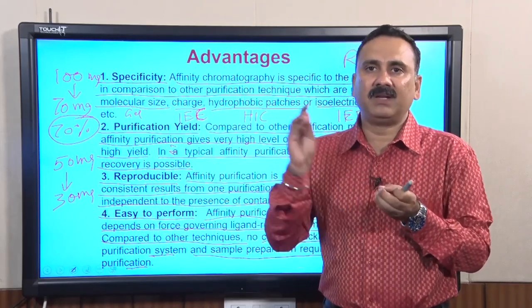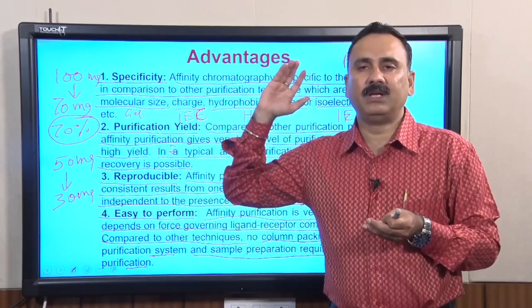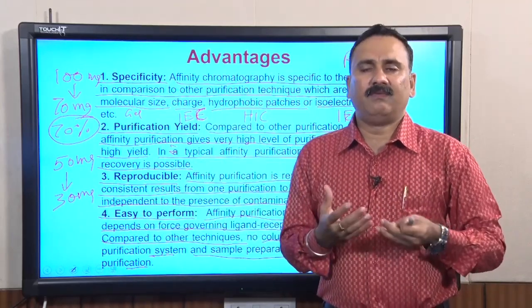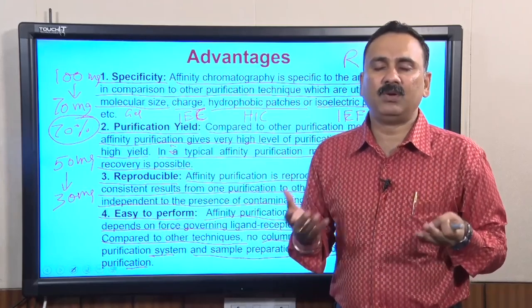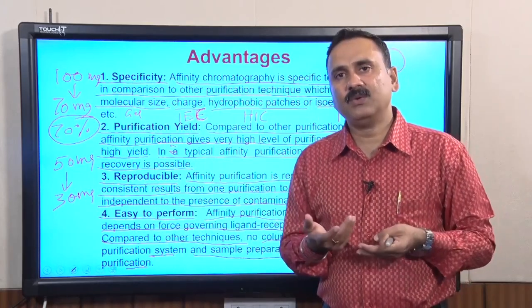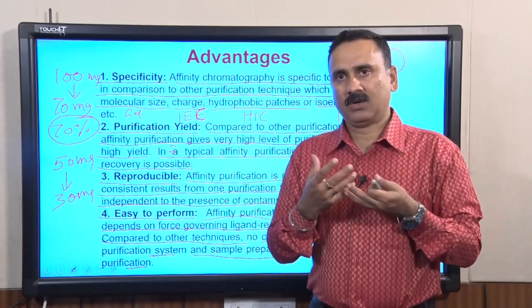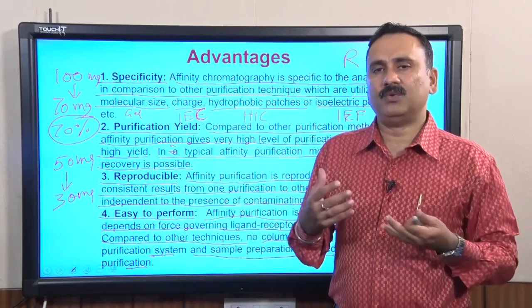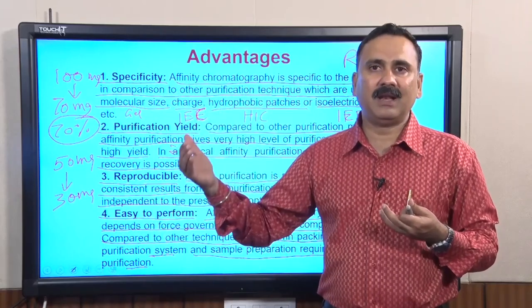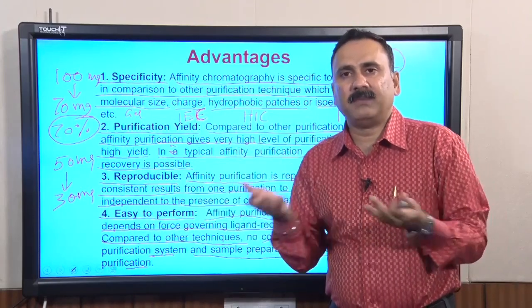These beads have the receptor or the ligand immobilized, and they have exclusive affinity for their counterparts, like the ligand or the receptor. So in these cases you don't need a very sophisticated purification system, or even to pack the beads. You just use them as such. You incubate your beads along with the complex mixture, and the beads will bind only your specific analyte containing the receptor or the ligand, and then you just do a washing step and that's it.